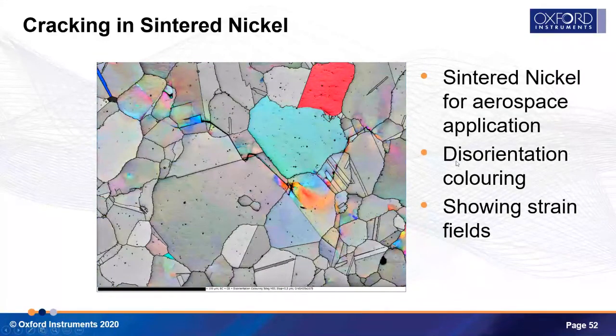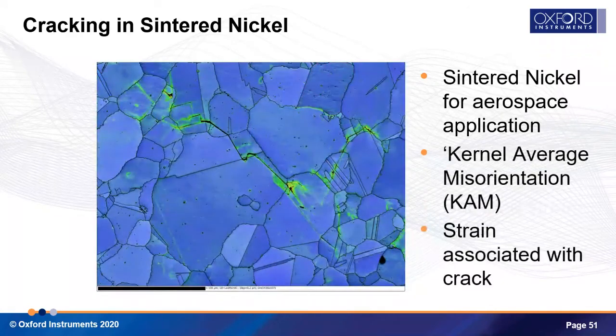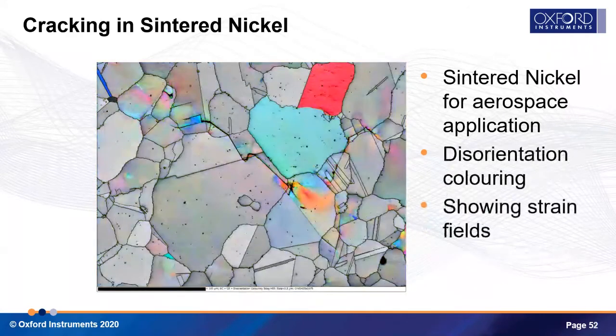This is a different color key called disorientation coloring, a subtly different approach. And here we see that the colors are rather different. And that's the nice thing about EBSD. You can pick and choose the color key that you want to apply to something to suit your purpose.